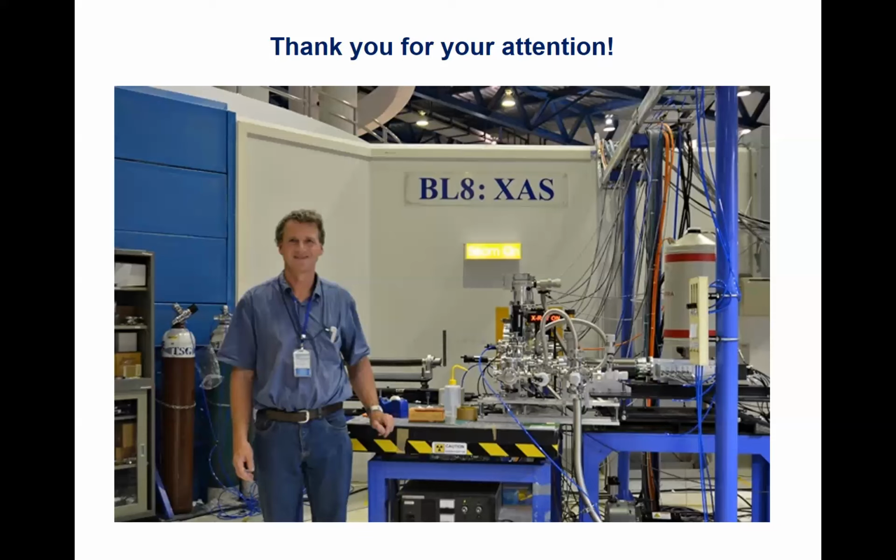Yeah, thank you very much for your two comments, which are both very valuable and important. Concerning self-absorption issues, there's, as probably most of you know, two issues. First is the thickness issue, and the other one is the concentration issue. It makes a difference if your element is finely dispersed, evenly dispersed, or if it's enriched in certain hotspots in your samples. It may cause self-absorption even if the total concentration is low.